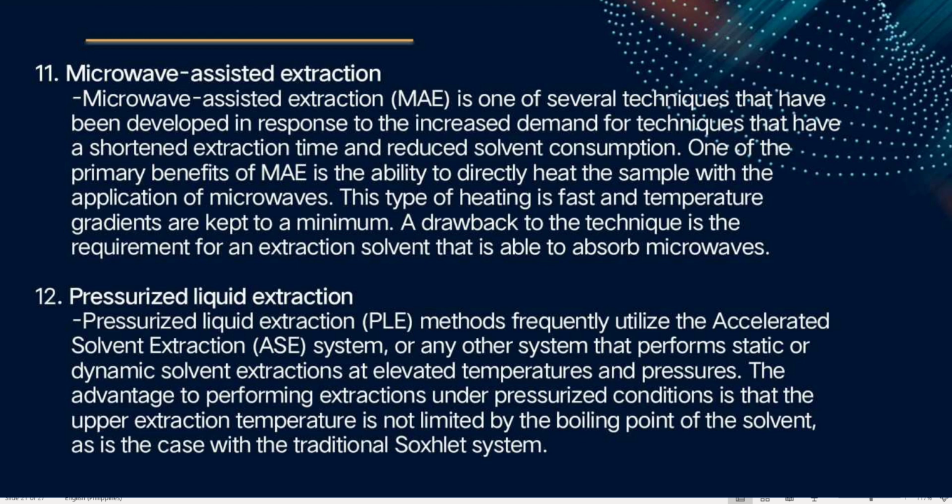Microwave-assisted extraction is a process of using microwave energy to heat solvents in contact with a sample in order to partition analytes from the sample matrix into the solvent.